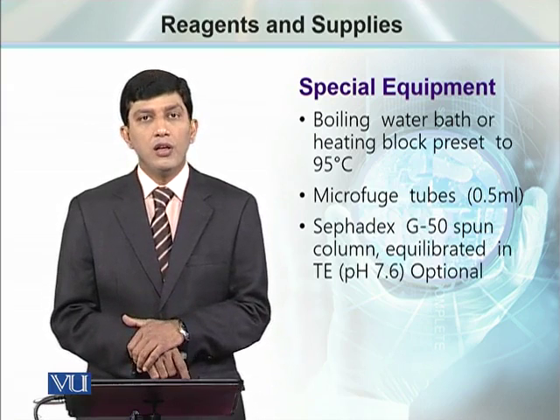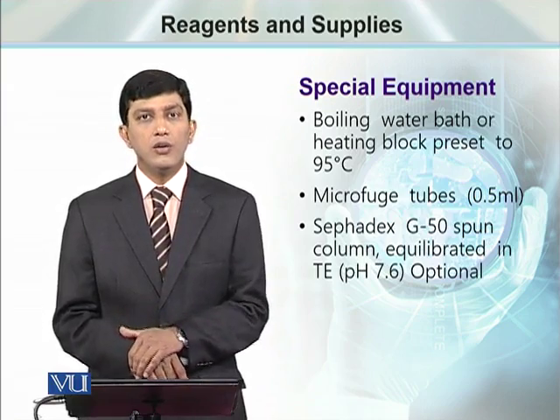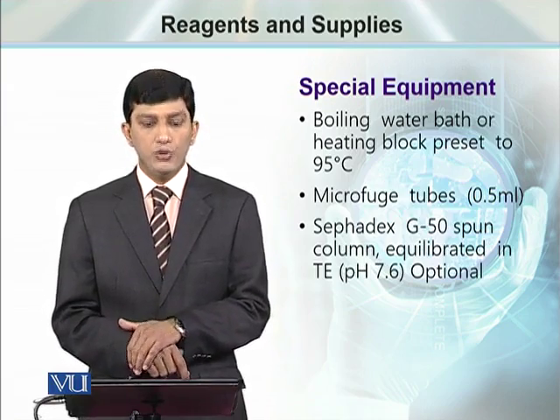This is again an optional requirement, and we have to decide if we need it or if we don't need it to prepare our probe using this method.